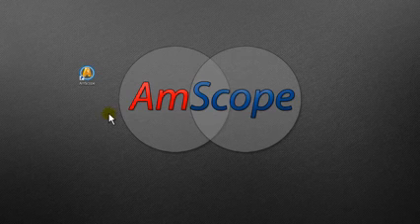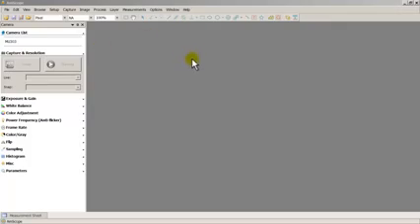Okay, so first things first, you're going to go ahead and make sure your software is installed. The newest software that we do have is version 3.7.3036. So before we start, let me go ahead and open this up and show you how to check if you have the most recent software. Okay, so I'm going to go ahead and double click on that, and there you go, it loaded.